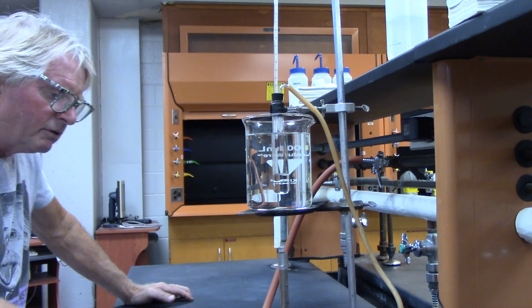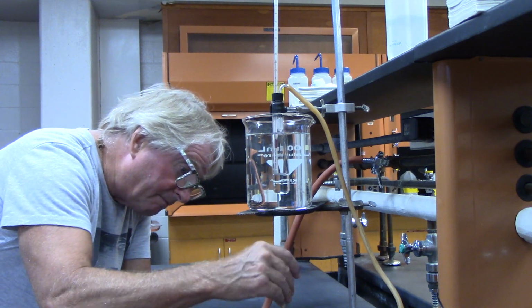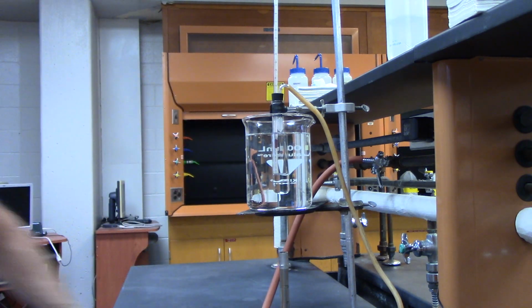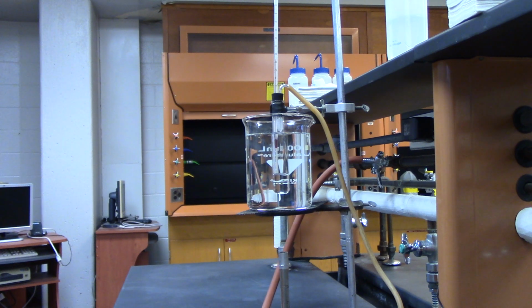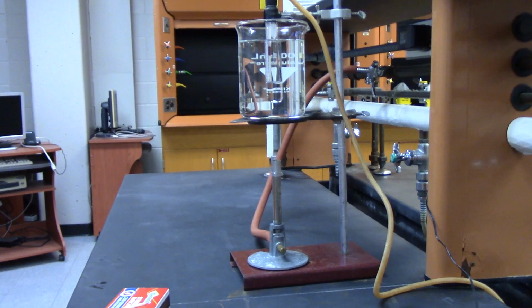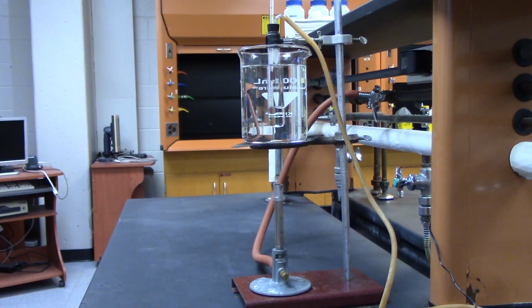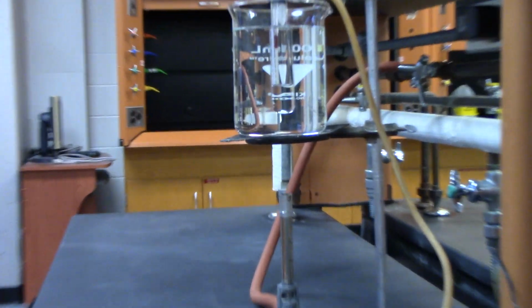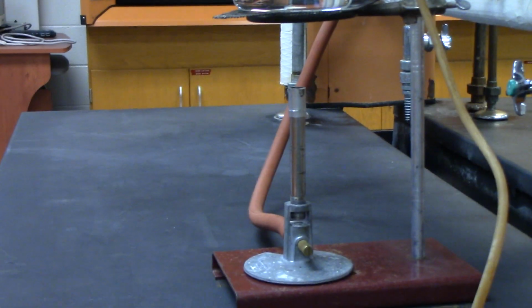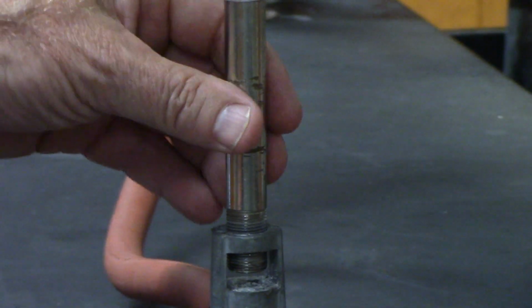So we have to make sure we have our air opening right here. You've got to have this open.